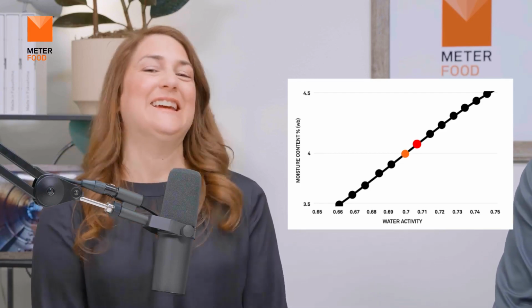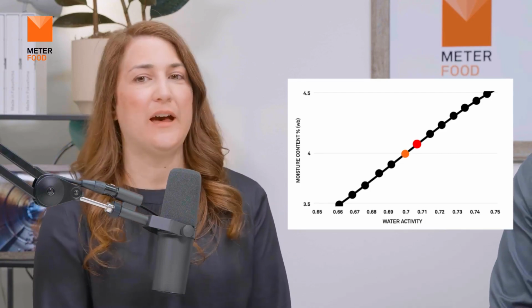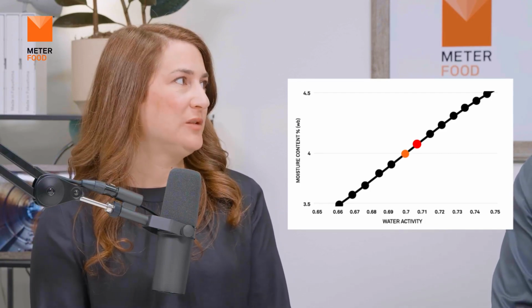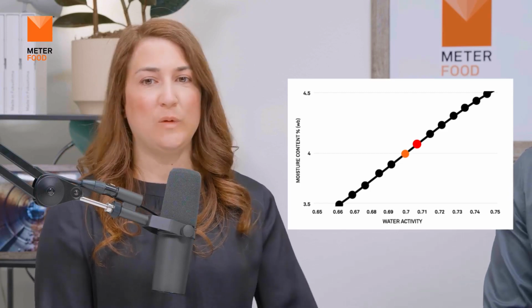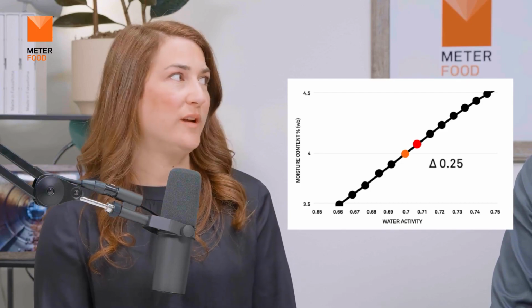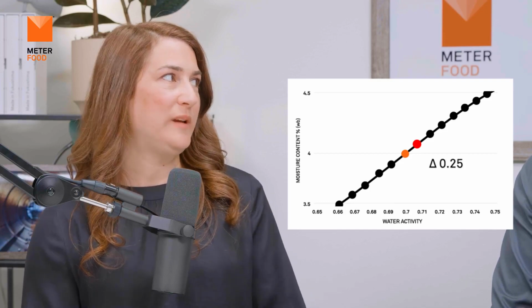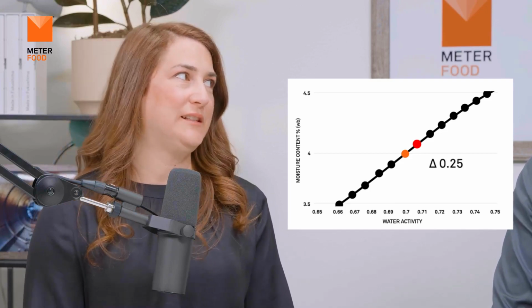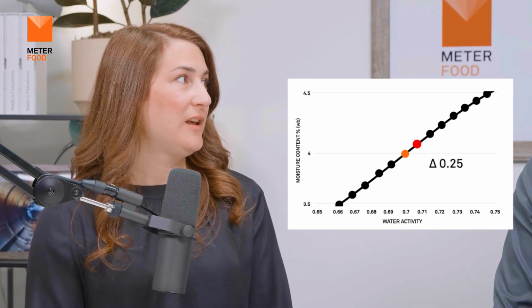Yeah, really good compared to what I normally see. Yeah, so you're thinking, oh, that's 0.5%, I'd be happy with that. But when we look at that relationship with moisture in the pecan, we have a secondary graphic showing a plus or minus of 0.25, so half of that, right? So if we say 0.5, it could be pushing it up a little or pushing it down. What does that mean in terms of safety and mold growth?